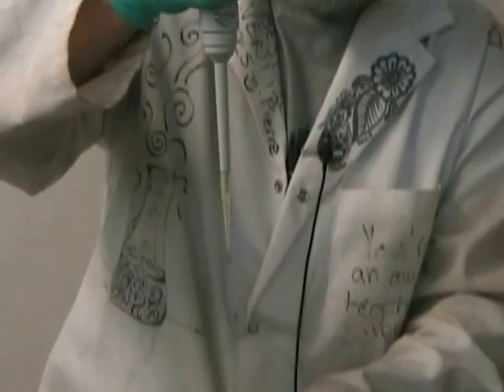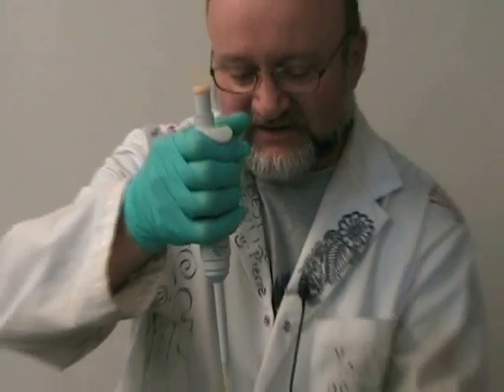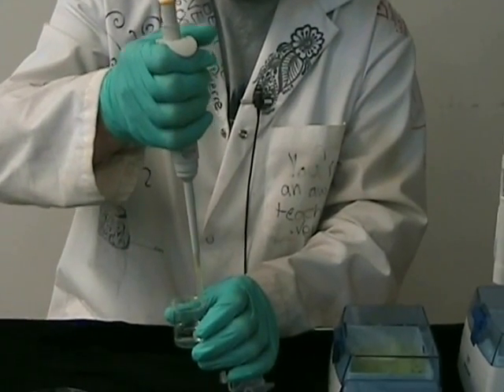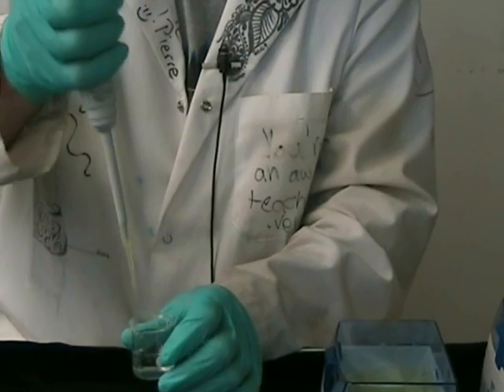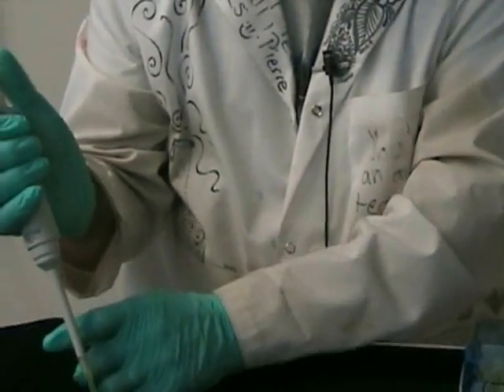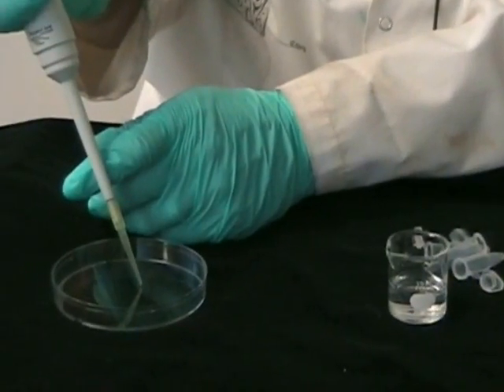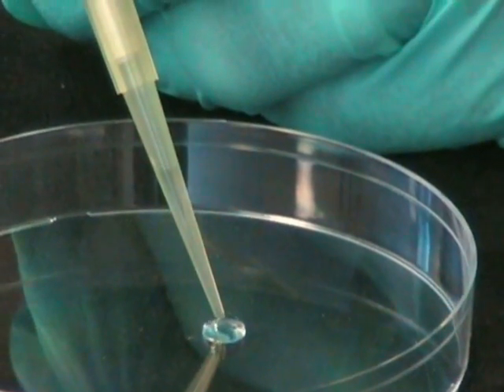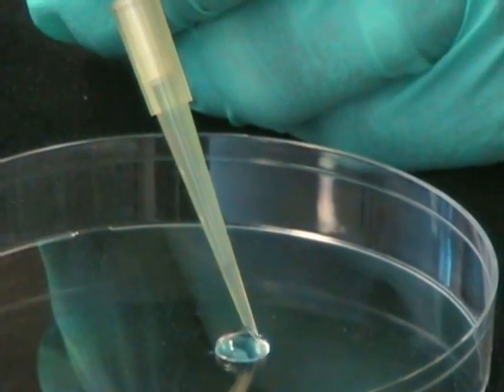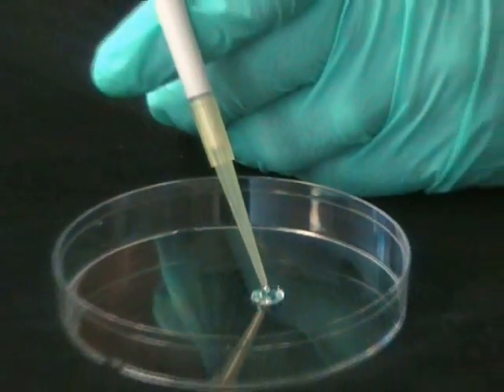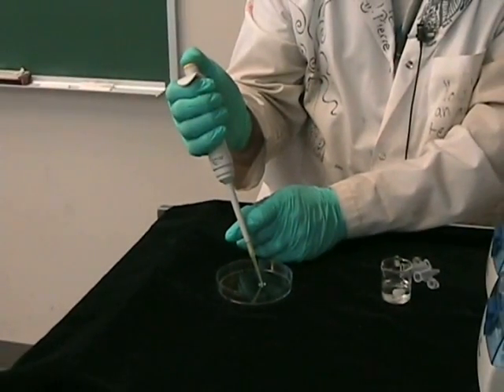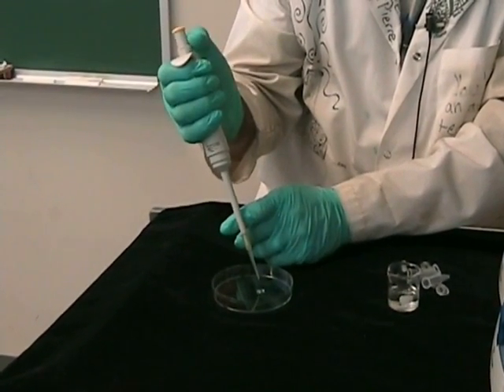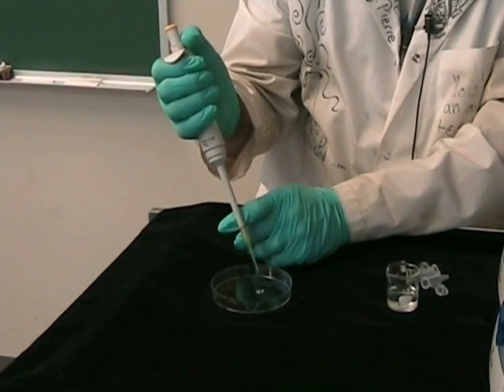Within the tip you have 100 microliters. You also have some on the outside, so you need to wipe the outside of the tip to the wall of your beaker. Now we're ready to transfer. Make sure you touch the surface lightly, then you press from the first stage, expelling the liquid. The last quantity in the tip is expelled by pressing through the second stage. You keep it compressed, withdraw, and only release the piston once you're out of the sample.